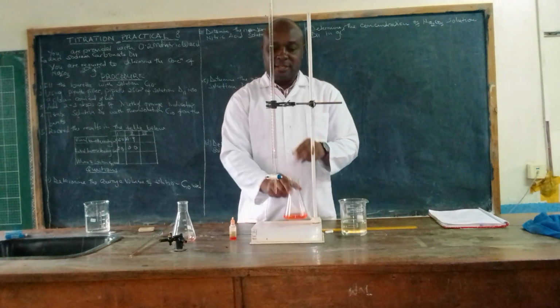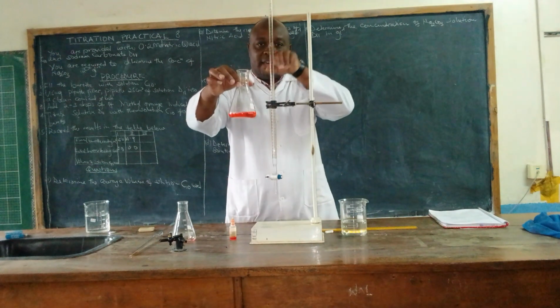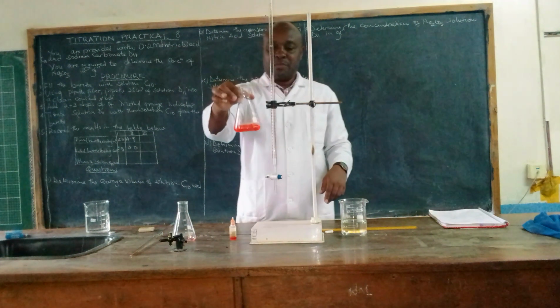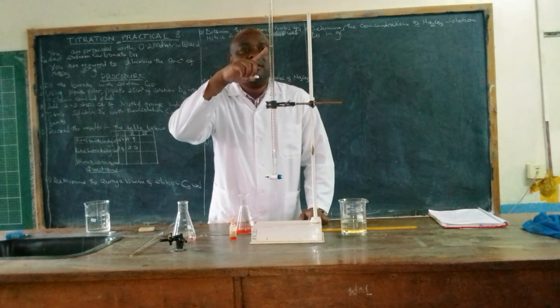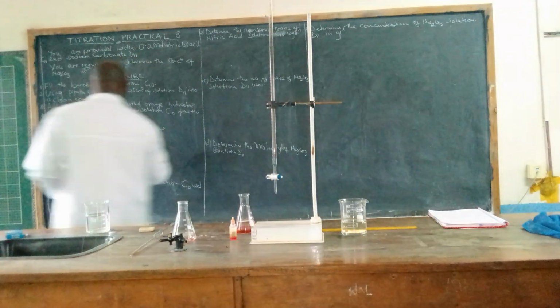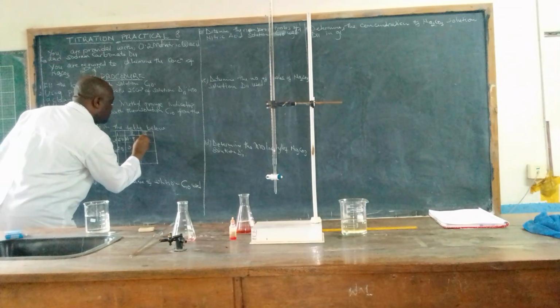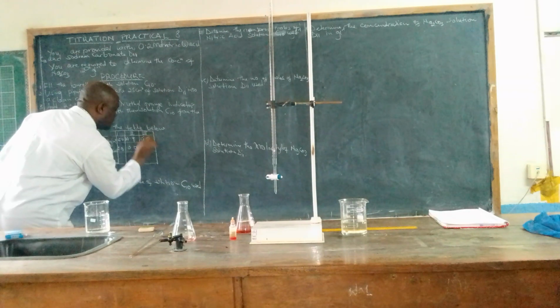As you can see, this is our third titration. So we come here and record. How much is it? 15.0. So we just come here and record 15.0.